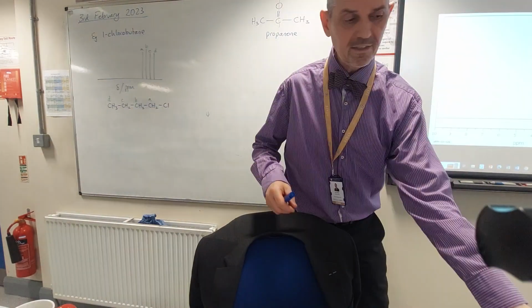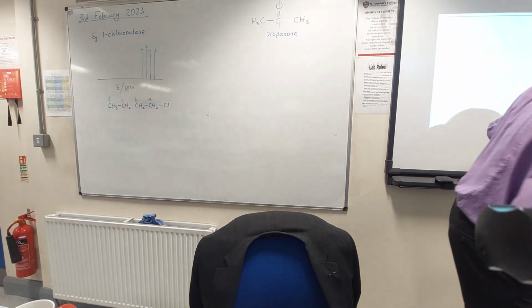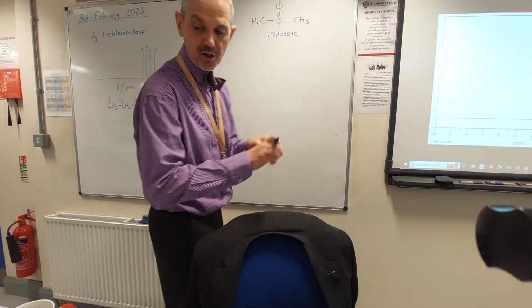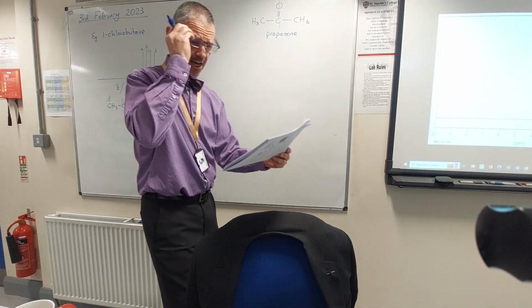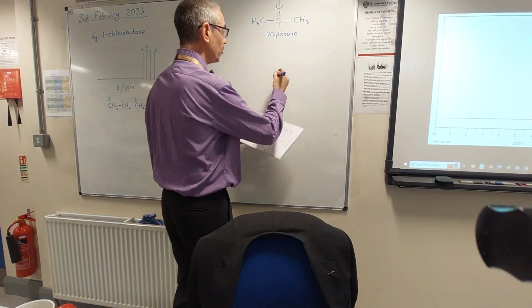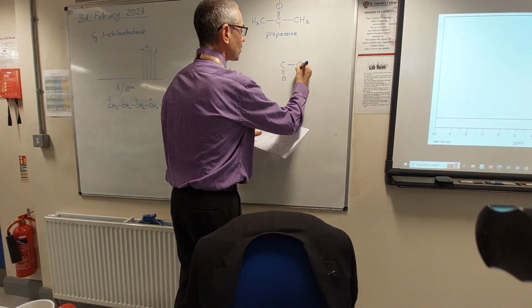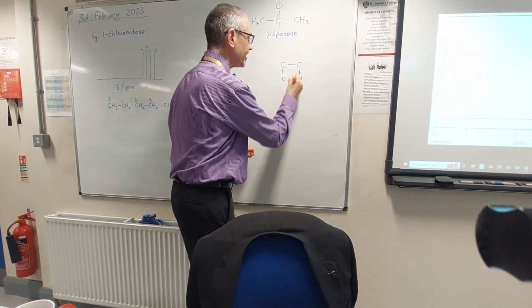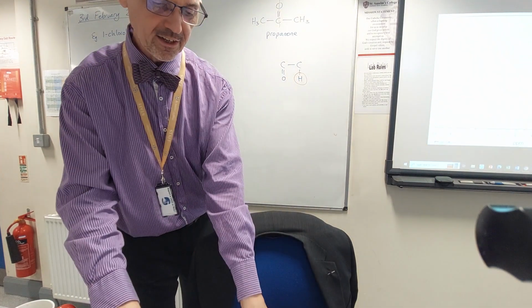And if we look at the chemical shift again, that peak is at about 2.2. So 2.2, if you look on table B, the proton NMR chemical shift data, corresponds to that hydrogen. Notice it's slightly bolded. We're looking at that hydrogen there.